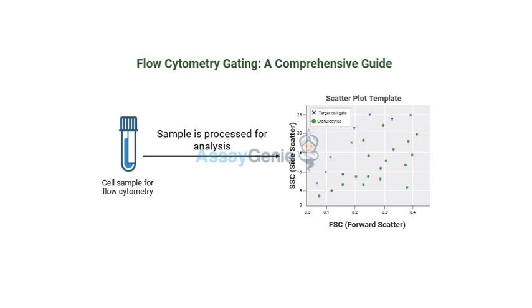Like if we're studying live cells, we can use a NOT gate to get rid of all those dead cells that we tagged with a viability dye. Oh, so it's like no dead cells allowed in here. Yeah. Boolean gating gives us a lot of control over how we define our cell populations. It's like having these filters so we can search for exactly what we want in our cellular database. Right. And it's really useful when we're looking for rare cells or trying to understand complex populations.